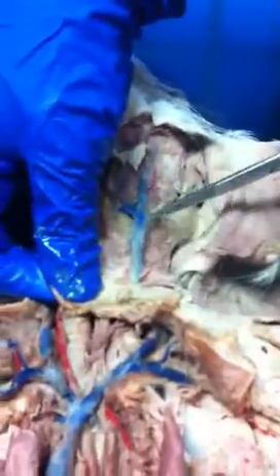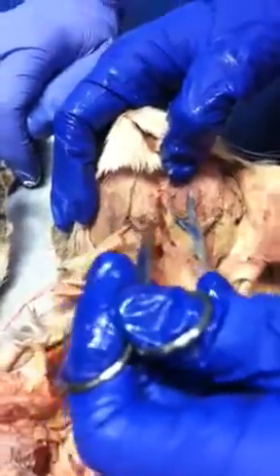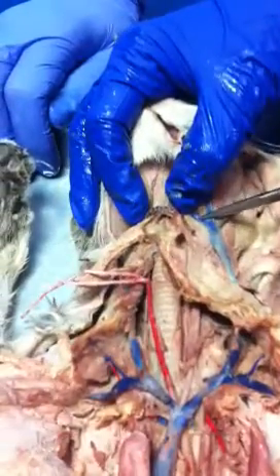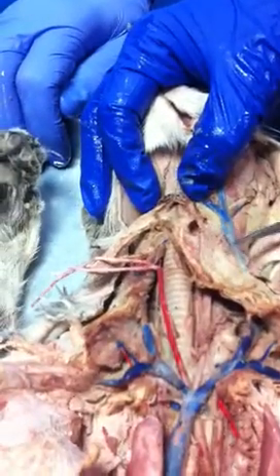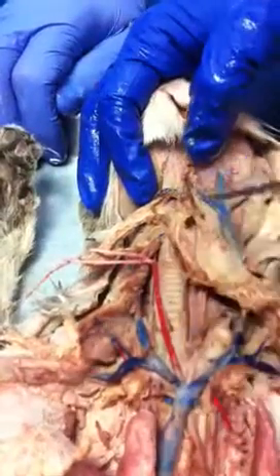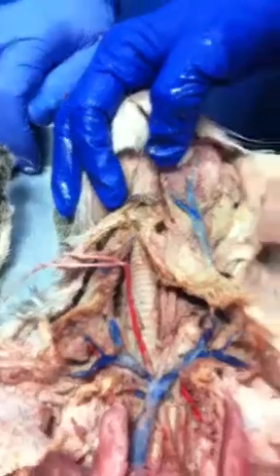See how your external jugular vein is going to come up and be very superficial? At this point, see this part that's going across where the hyoid is? That is your transverse facial vein. Once you see that transverse facial vein, there is no more external jugular. This is external jugular. That is external jugular. But once you see transverse facial, this is now anterior facial and posterior facial.